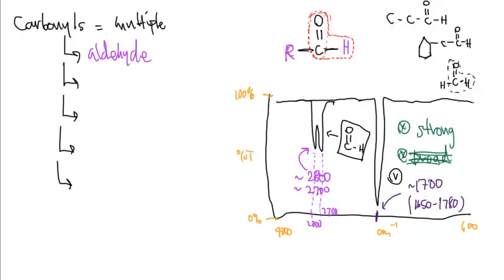So something that maybe I haven't mentioned yet, but hopefully by looking at the infrared, you've seen and observed it. These double dips, when they happen, are about the same size, meaning that intensity-wise, they come down about the same position.